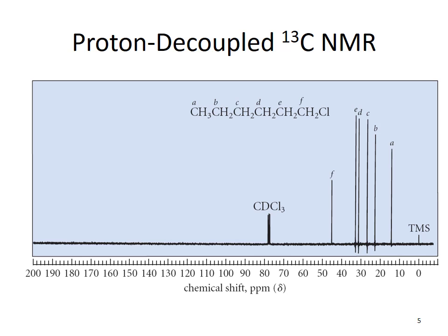Here is a carbon-13 spectrum. Here is our TMS at 0. Notice my primary carbon is all the way upfield. It's also farthest from the chlorine. All the way upfield, almost at 10. Then we have the next in line, then the next in line, then D, then E, then F.